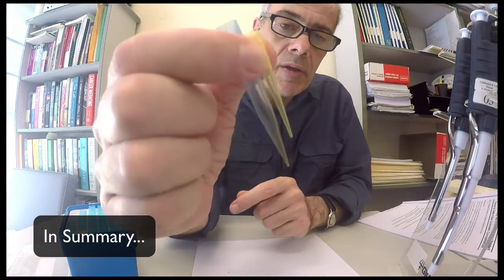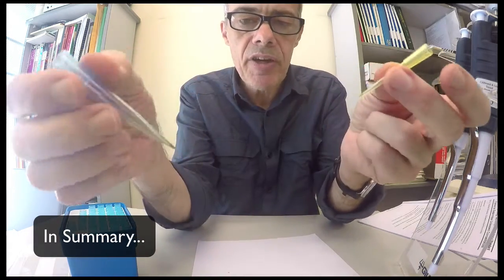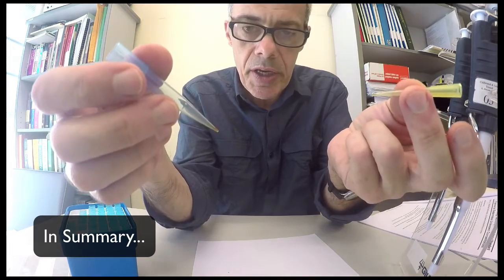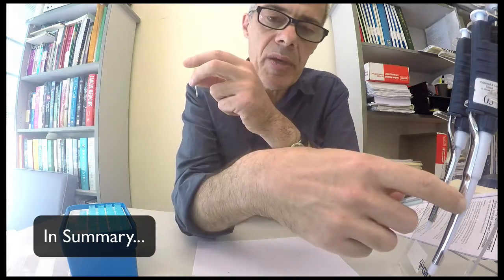Be sure to use the correct tip for the pipette. There are various size tips. I've shown you two here. The blue one is for the P1000, the yellow one is for the P200.